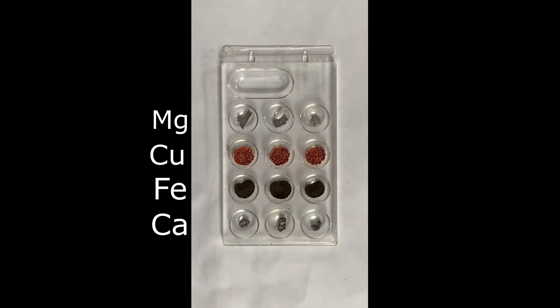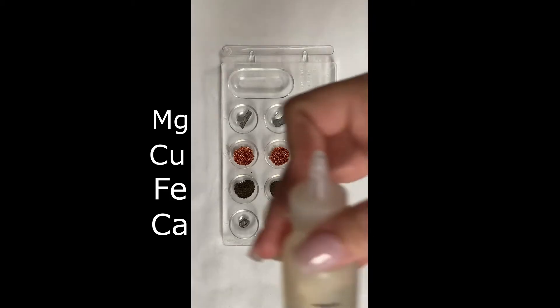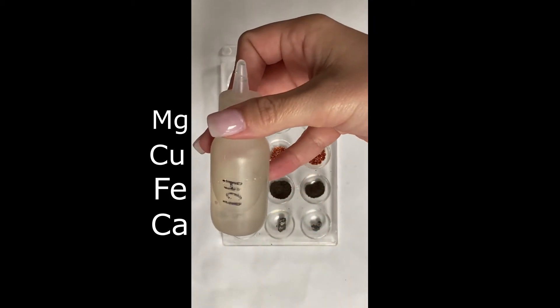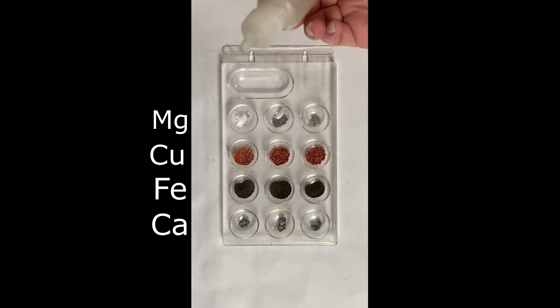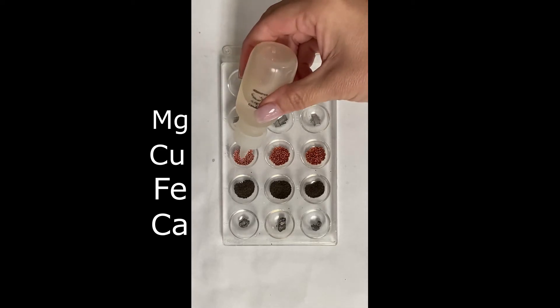Okay, so I went ahead and I labeled our metals for you. We put them in a little well plate. You don't need a whole lot of each sample. We're going to go ahead and start with hydrochloric acid, and we're going to go straight down the row so we can keep it nice and organized and neat, and we know which one is which.